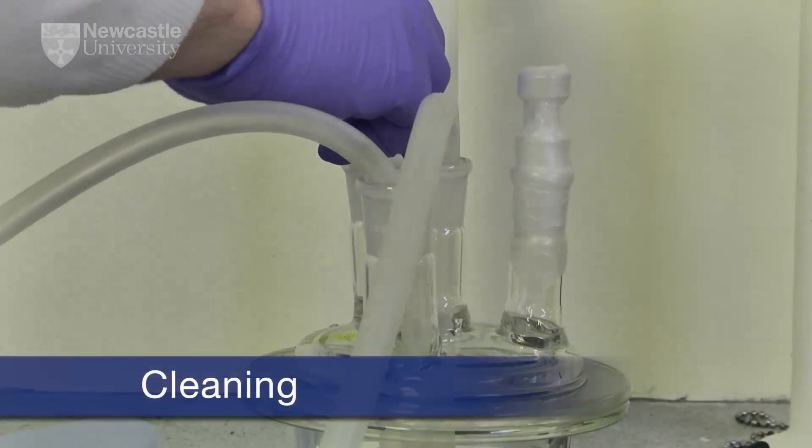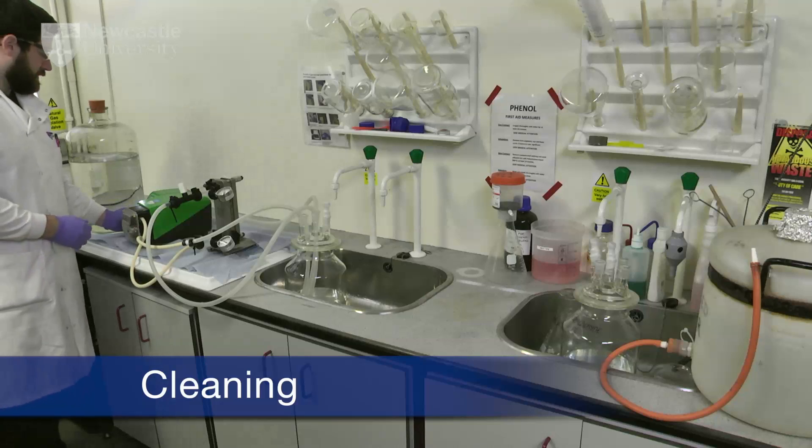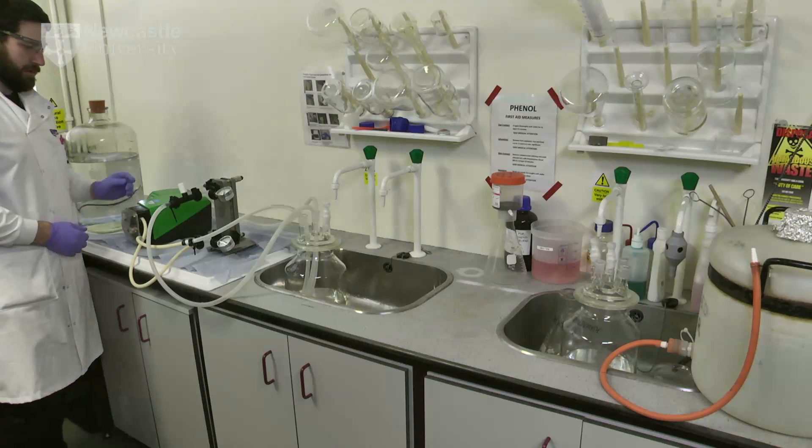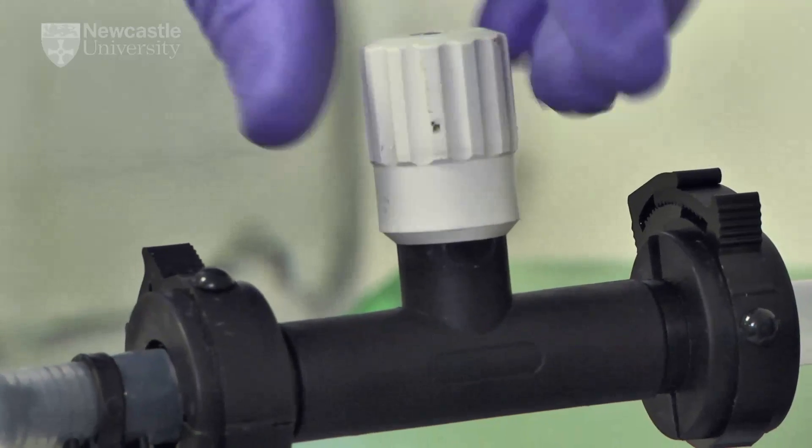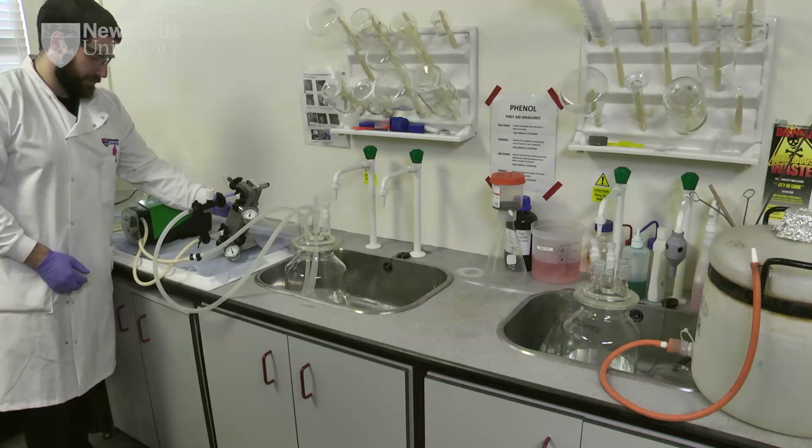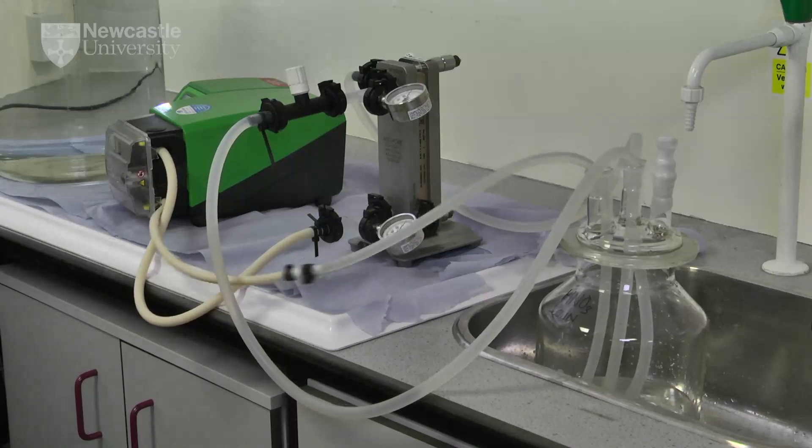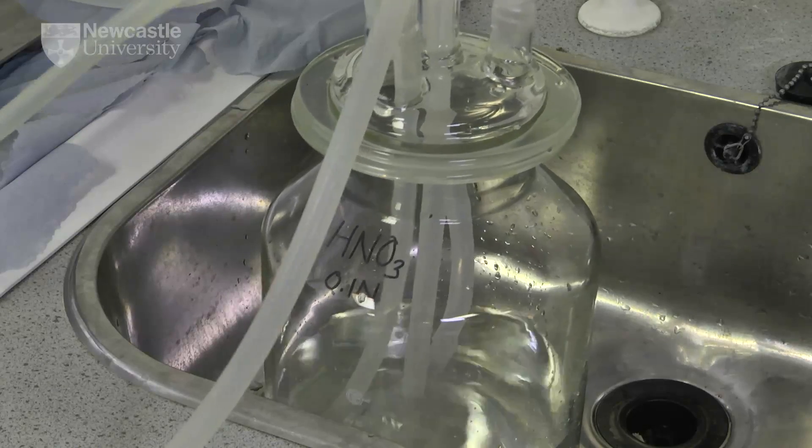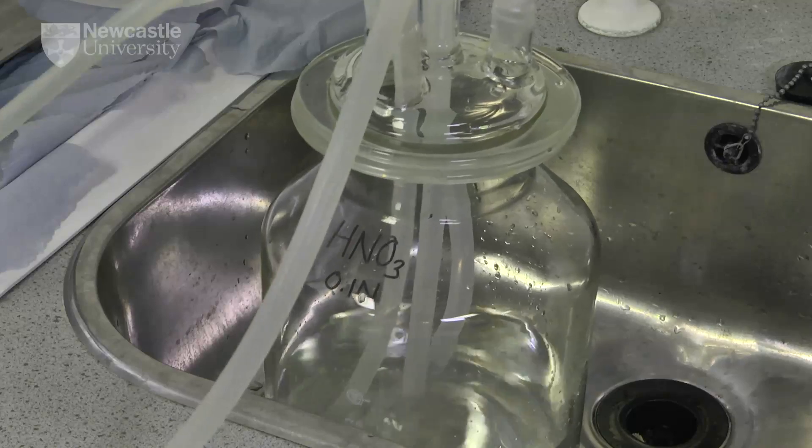A cleaning solution is then recirculated through the system for approximately 30 minutes. The retentate valve should be fully opened and closed several times to wet all internal surfaces. The solution, concentration and duration of cleaning is dependent upon the filtration cassette selected.